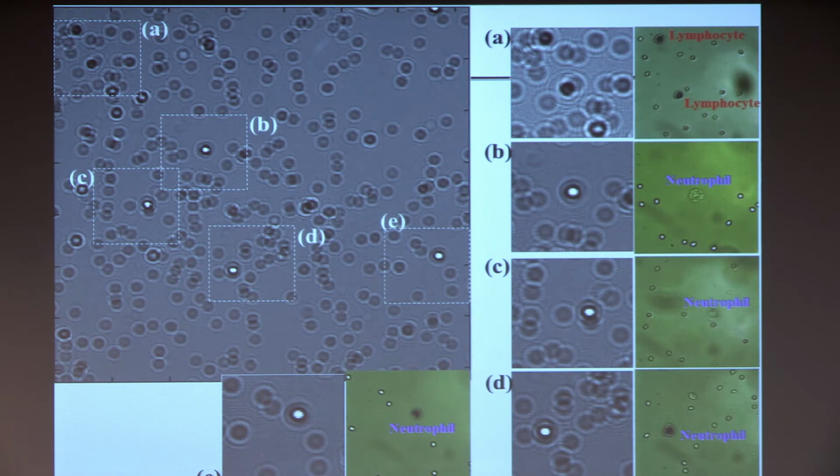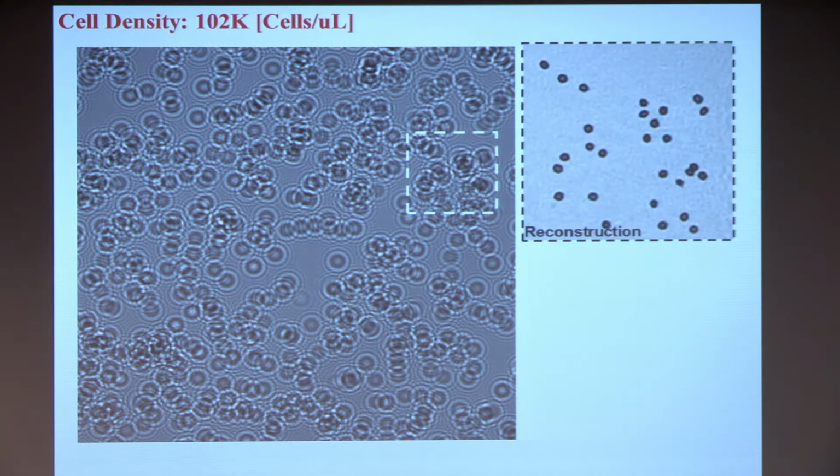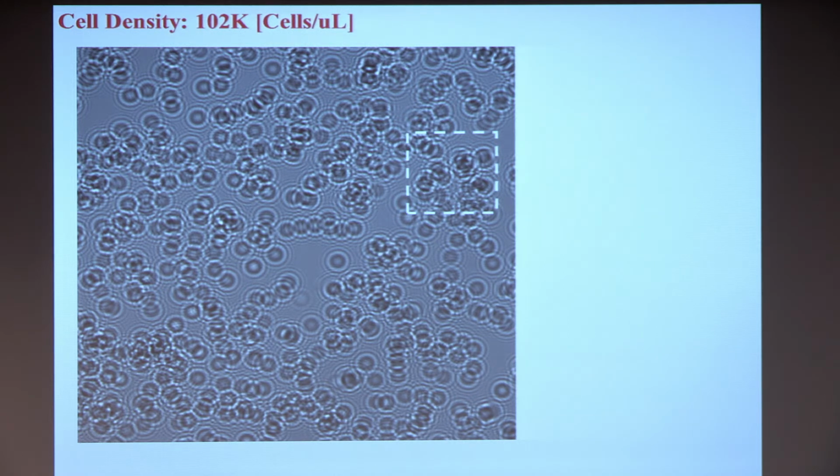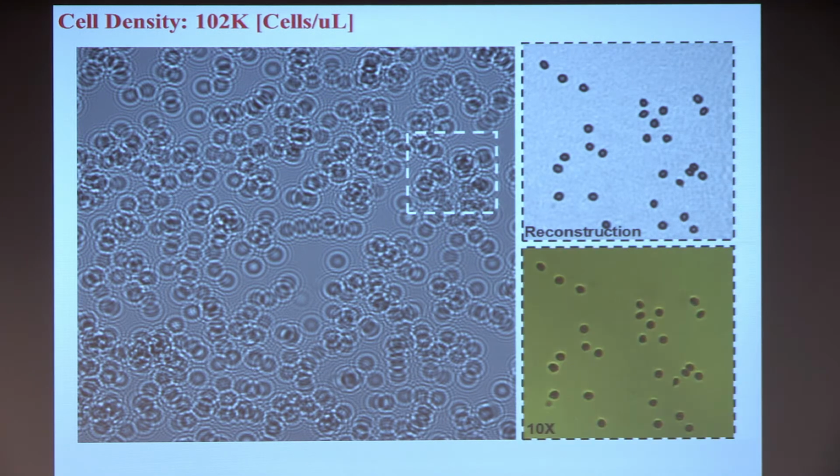At the raw image, for example, if you look at whole blood, you'll be seeing shadows of these red blood cells, sometimes white blood cells. It can work like a cytometer to count cells, but it's more advanced than that because these shadows are actually holograms. They contain useful information which can be inverted computationally. A field of view like this within a few milliseconds can be reconstructed using Fourier optics tricks to give you images of the cells at their plane, creating these shadows, nicely matching a conventional microscope image. Except that there is no microscope, there's no optics. So it becomes very powerful.